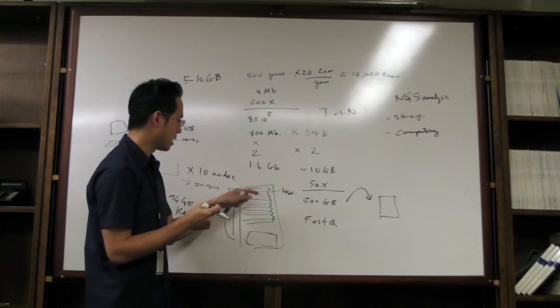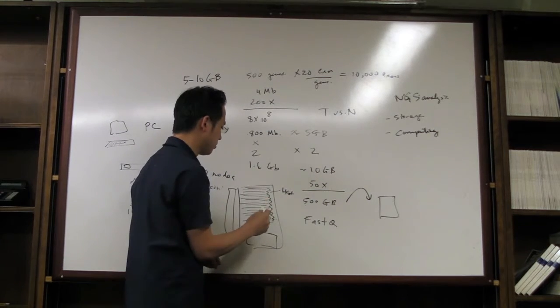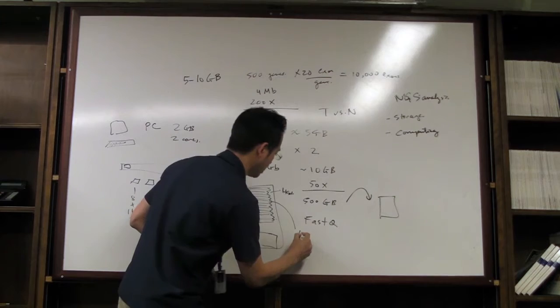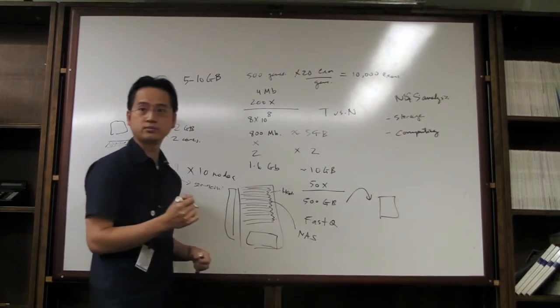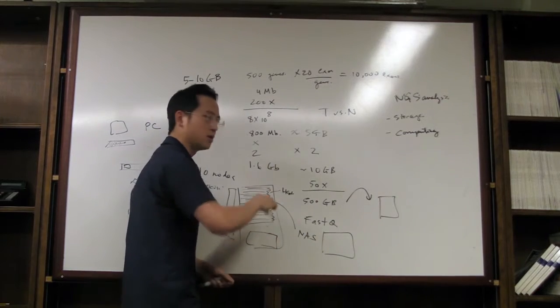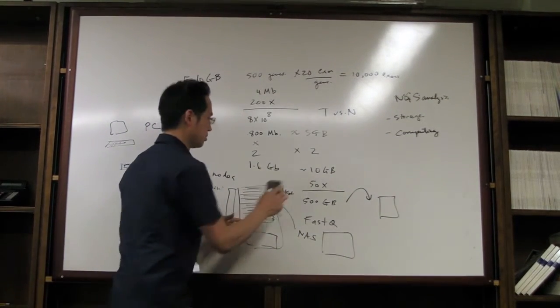And what else is there? So now that's just the computing, right? So the storage will have to be somehow attached to this. So people typically do a network attached storage server. So this could be another box sitting in the same room, or it could be in a separate location that you need. Let me erase some of this.